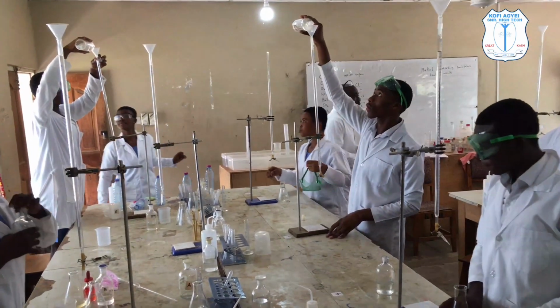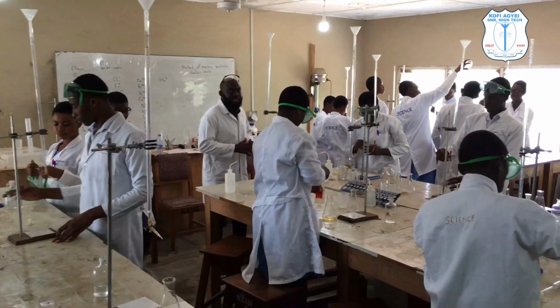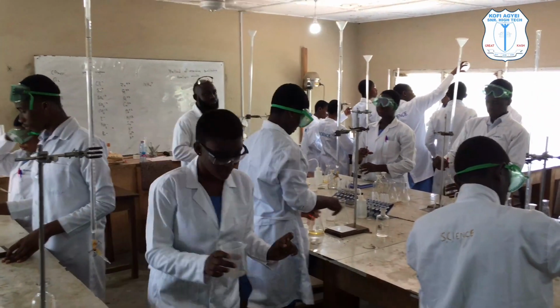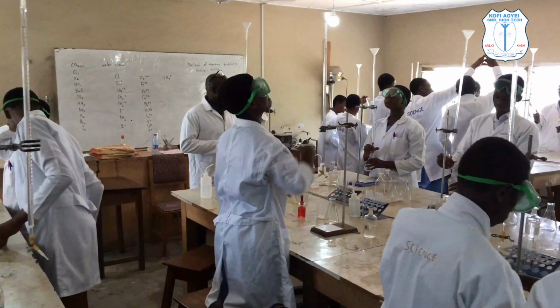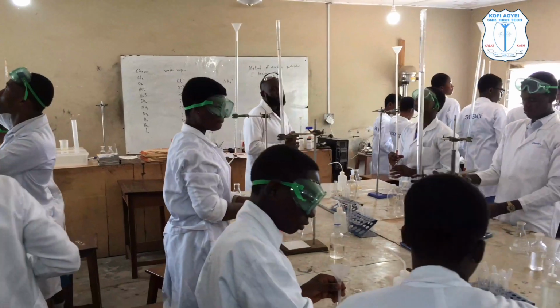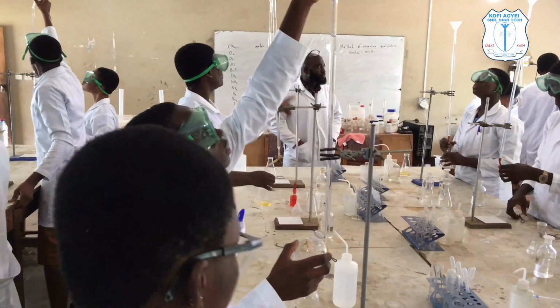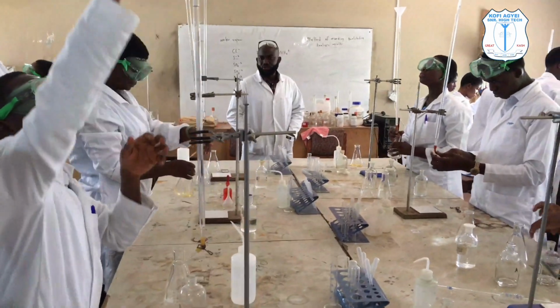Have you done that? So set up the 0 mark on the burette. Set up the 0 mark on the burette. So hurry up.